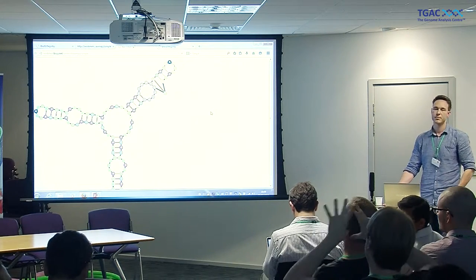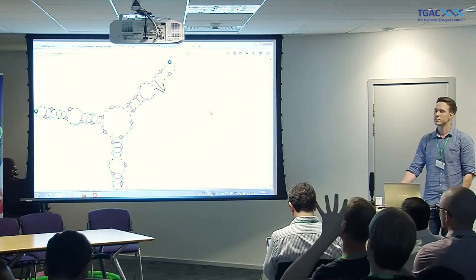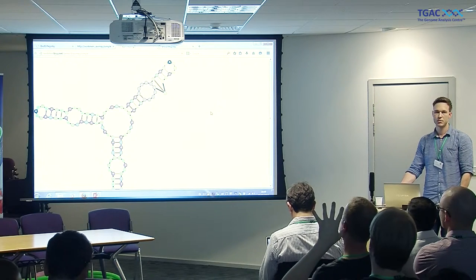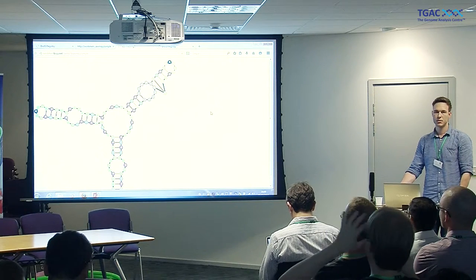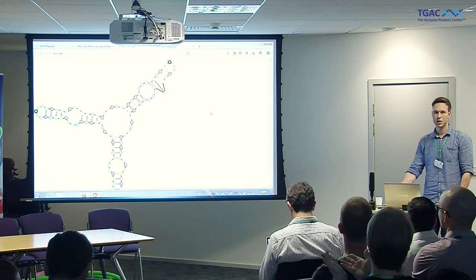Question: So all those controls around it — are they part of the component, or is the component just the visual bit? Answer: There are several examples, and you can have it with or without. The parts around it are HTML, and the component itself is basically only what you can see here.